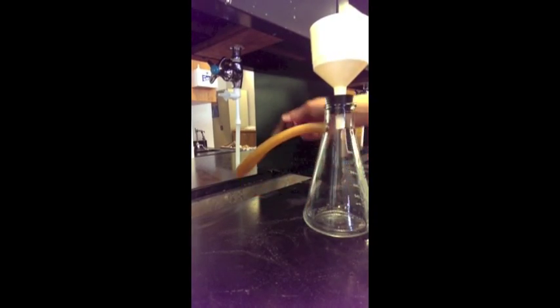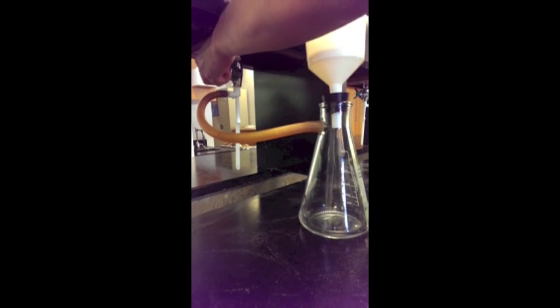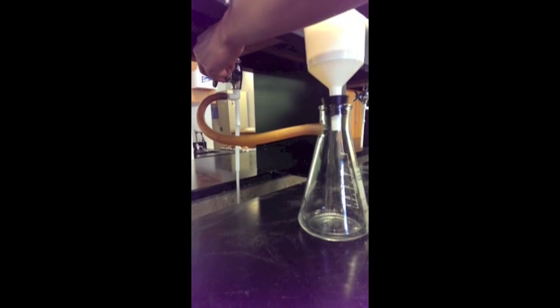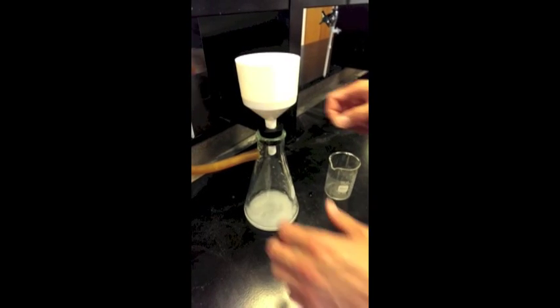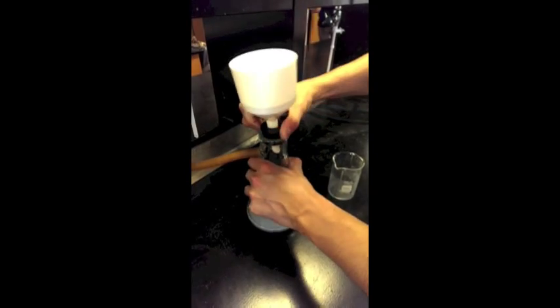Connect the tubing of the Erlenmeyer flask into the side of the water faucet and turn on the water to form a vacuum. Then place a piece of filter paper into the Buchner funnel. Pour the precipitated solution into the top of the Buchner funnel. Rinse the contents of the beaker with additional distilled water and pour it back into the funnel. Repeat this step several times until the filtrate is clear.